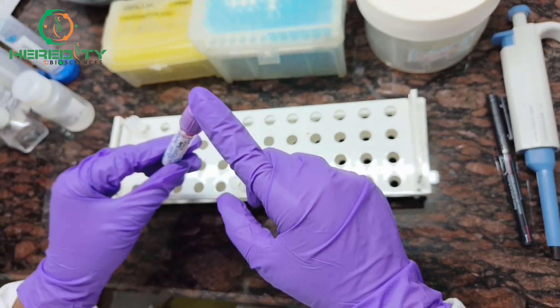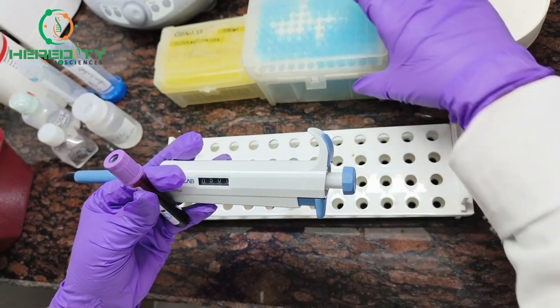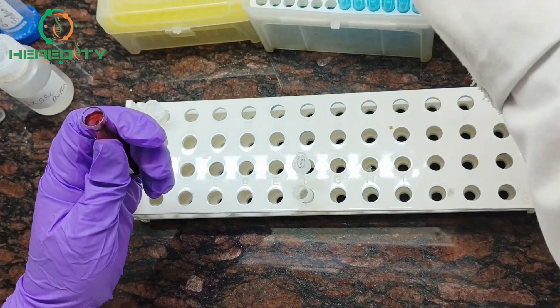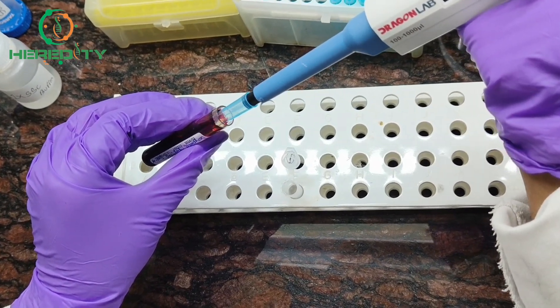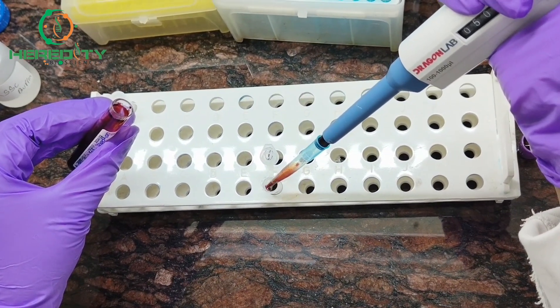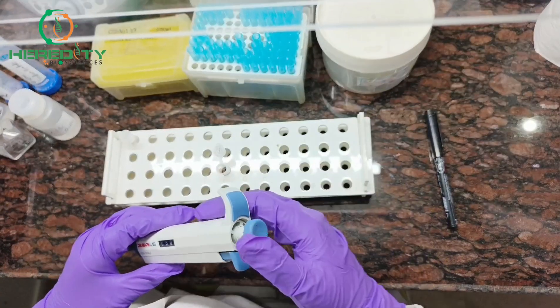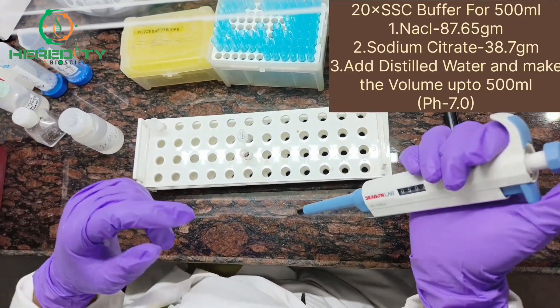First we will take 500 microliters of blood sample. After that, we will add 1 ml of 1x SSC buffer. I have already mentioned the composition of SSC buffer on the screen.